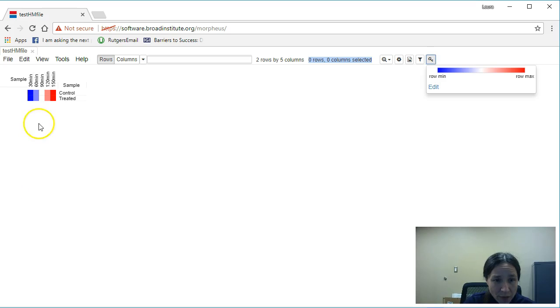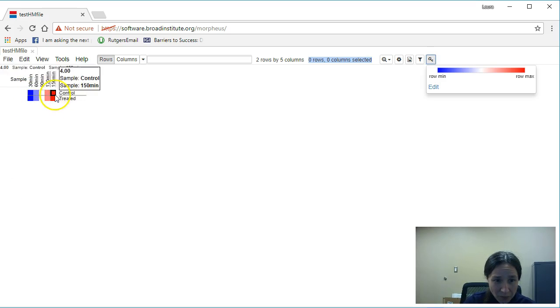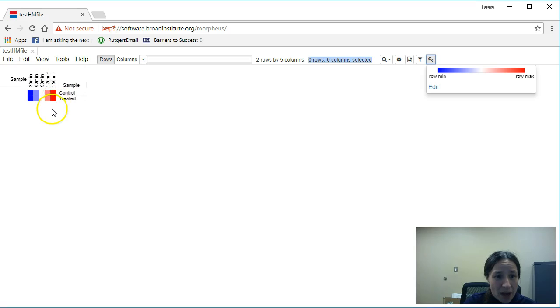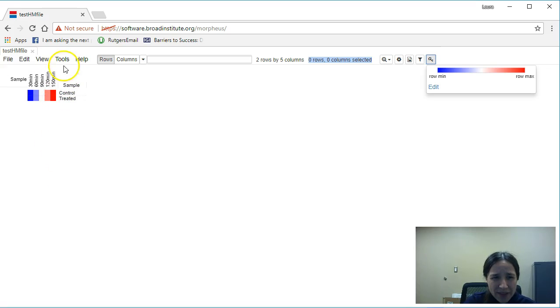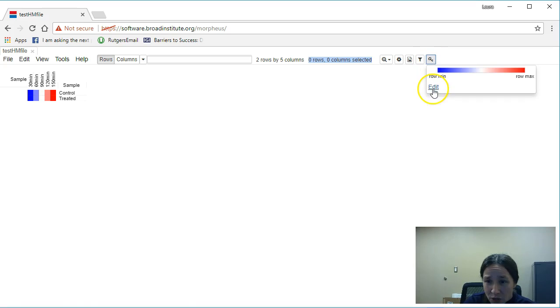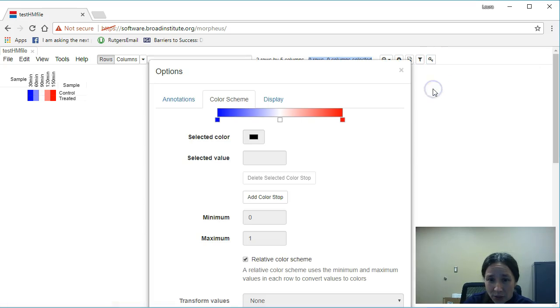So therefore my blue would be my leftmost column, my red would be my rightmost column. However, that doesn't accurately represent the data as we see it. So we can go ahead and edit those colors.